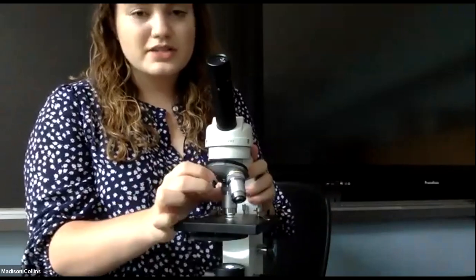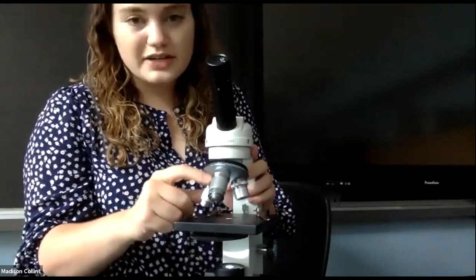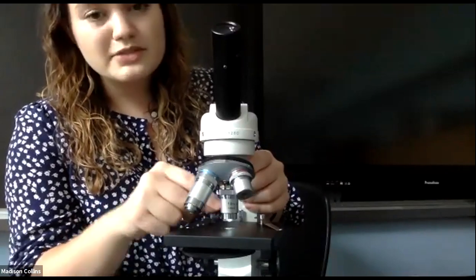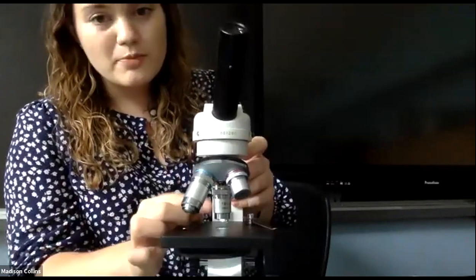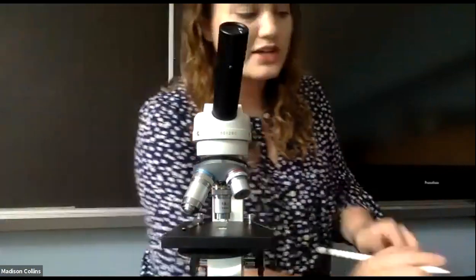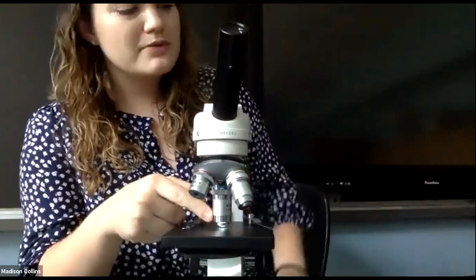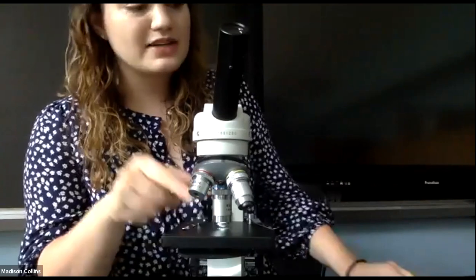The only 2 lenses we're going to use this year are this yellow lens right here that we're going to call low power objective, and this lens right here with the blue ring that we call the high power objective. So when we're viewing things through the low power objective, this yellow lens right here, that's going to magnify our image 10 times. Again, remember our eyepiece is 10x and our low power objective right here is also 10x. So please write down that the low power objective also has a magnification of 10x. Okay, but when we're viewing things through the high power objective, this blue lens right here, that's going to be a magnification of 40x. So please write down on your paper that the high power objective has a magnification of 40x.